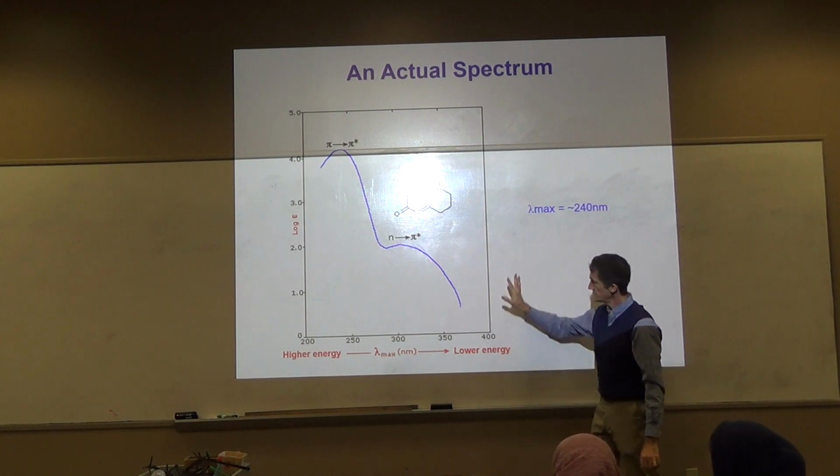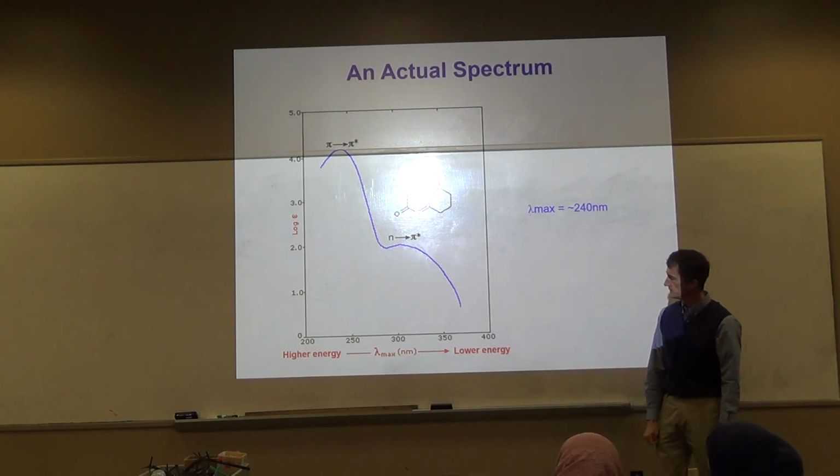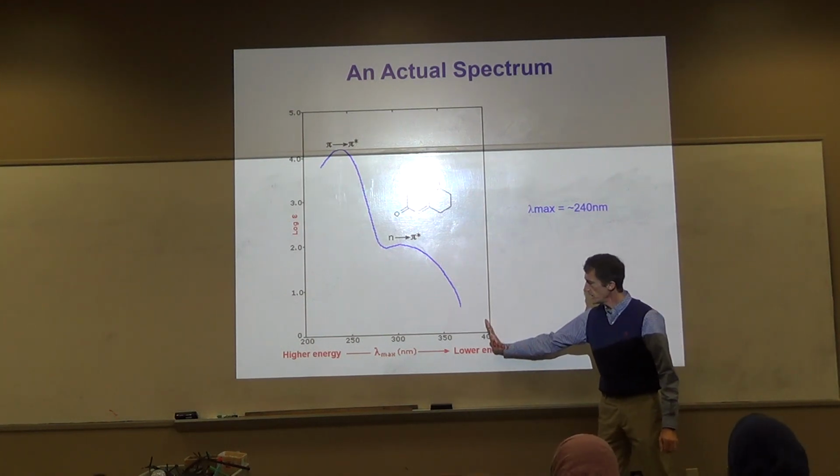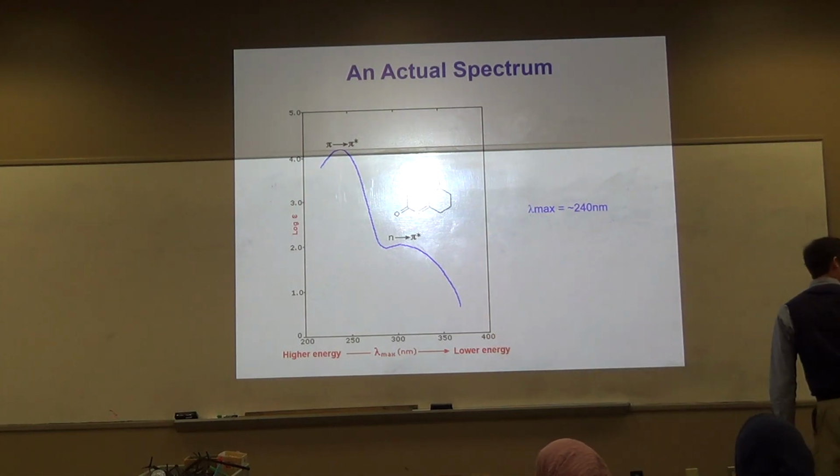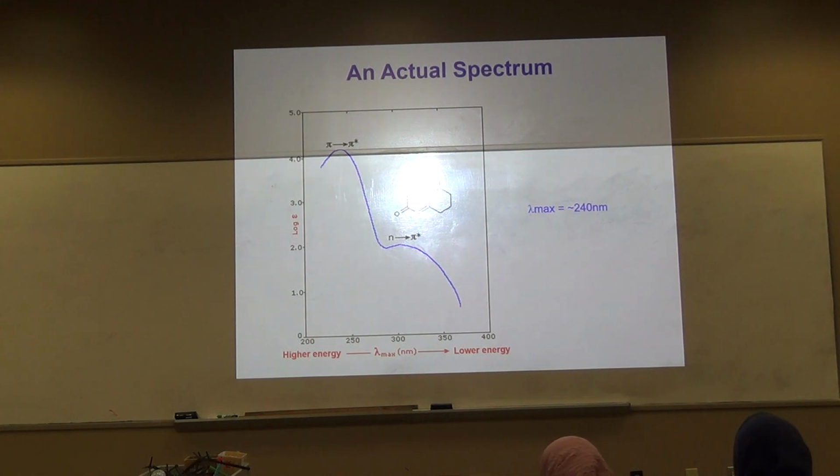Does this compound seem to absorb in the visible? No. Visible starts at 400 to 800. Apparently not. It's kind of coming and nothing out here. It wasn't even scanned.